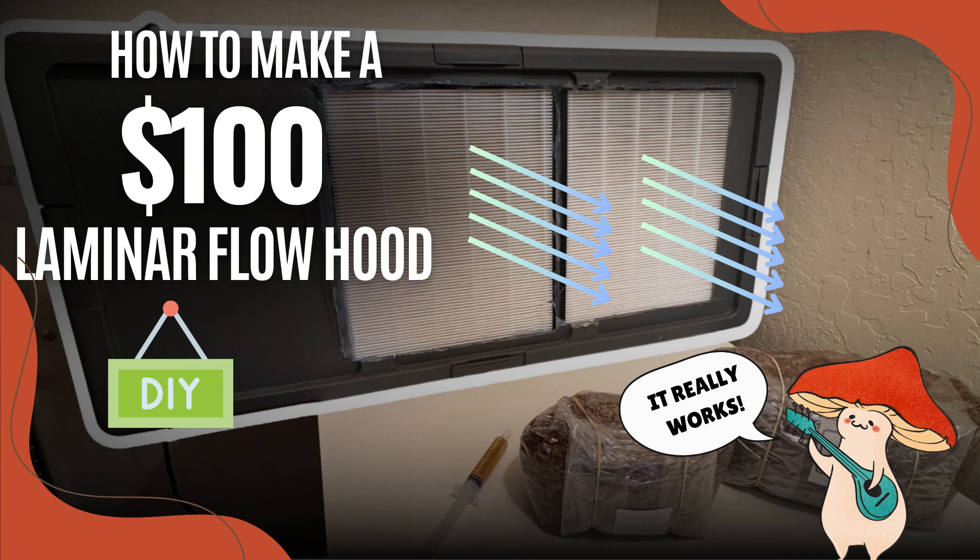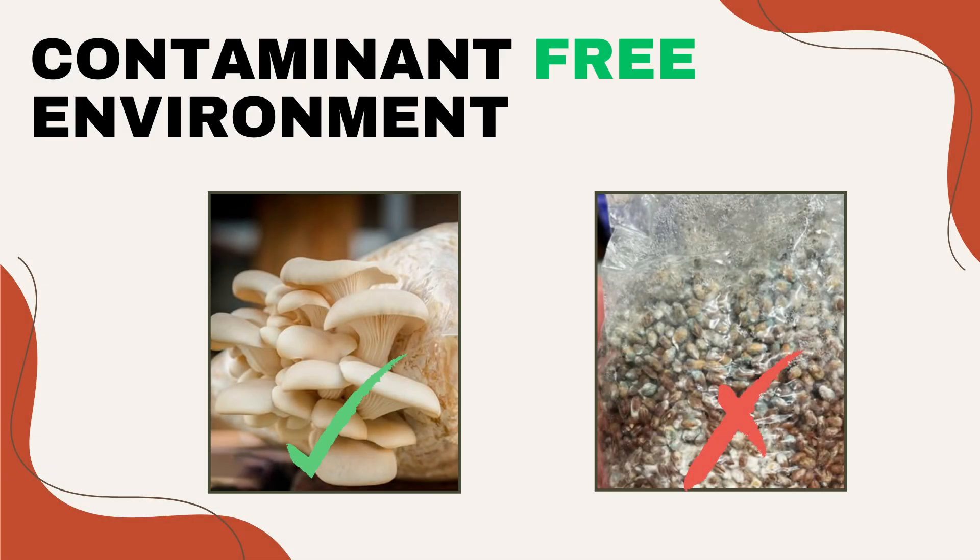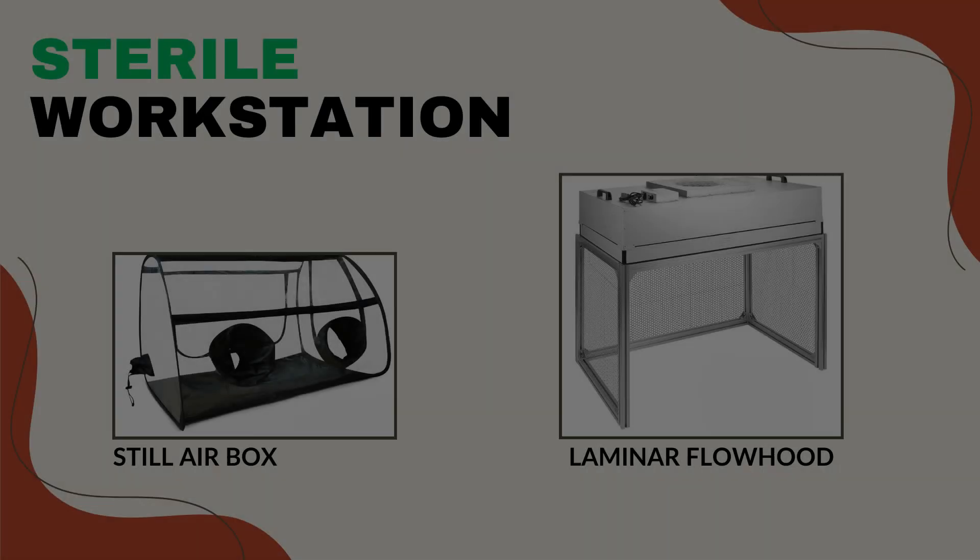Hello mushroom lovers and welcome to the mushroom room. Today we're going to build a laminar flow hood for only a hundred dollars. It won't win you any prizes for beautiful design, but it's highly effective and it just works. One of the most important things when growing mushrooms at home is to keep your environment contaminant free — after all, we want to grow spawn bags and fruiting blocks, not bags of green or black mold.